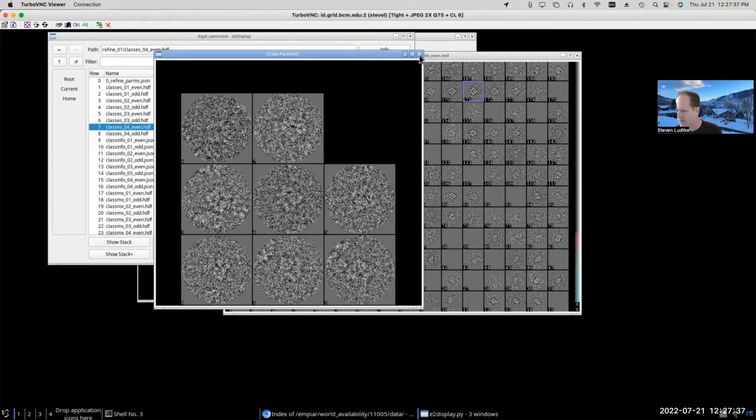Now, how would you go about storing that information in the star file? Right, the information about which particles went into the class average. The way you pretty much have to store that in a tabular form would be the other way around. Instead of saying, here's a class average, which particles went into it, you would have to say, here's my list of particles, which class did each particle go into?